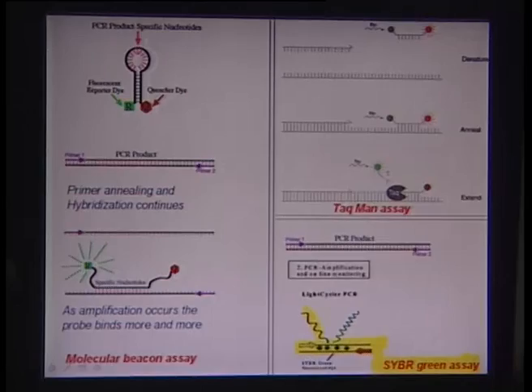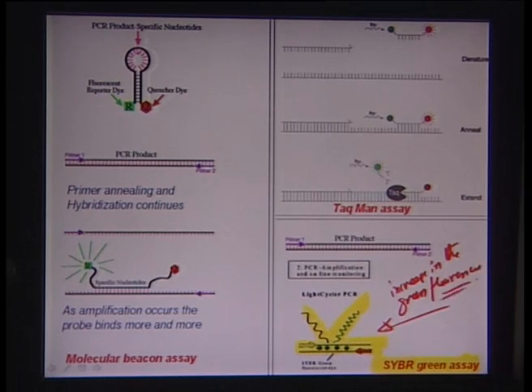If there is an excitation at a certain lower wavelength, it results in an emission in the green region for SYBR Green. The idea is that as these copies of DNA molecules grow along a successful PCR reaction, we should get an increase in the green fluorescence. This makes sense because the more copies there are, the more the dye, which is available in plenty in the reaction, intercalates, and you should get a snapshot of the overall concentration at a certain point of time in the reaction.